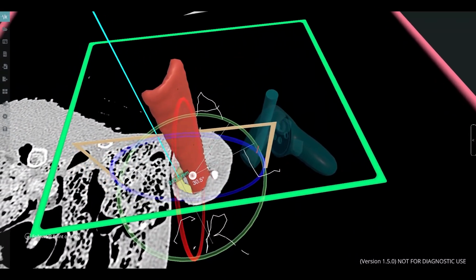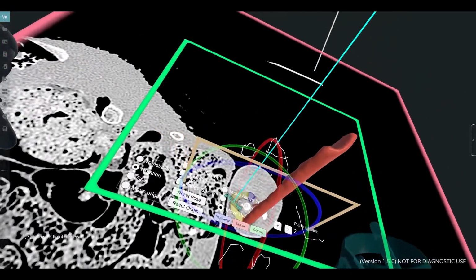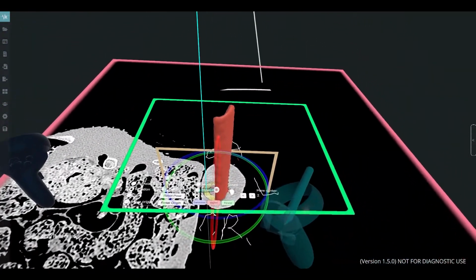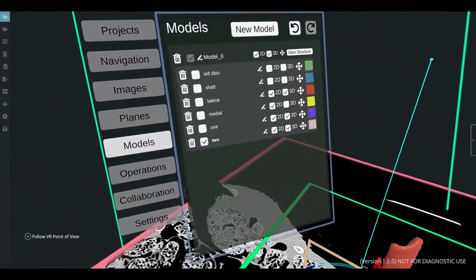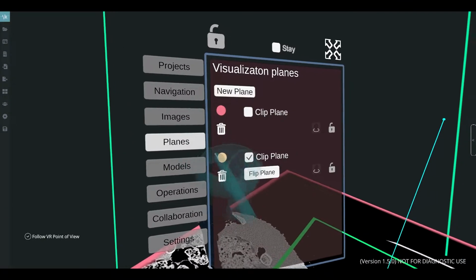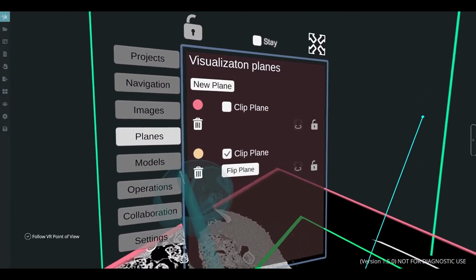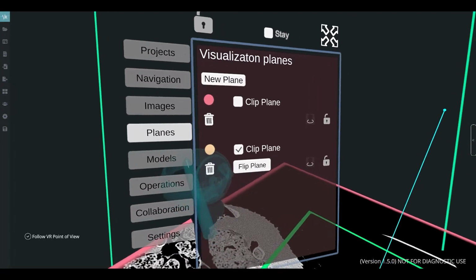We're going to put this video on YouTube, so it's possible to just sort of speed through it. You don't have to watch me. You're repeating the same operation again and again. I actually made a mistake in this video in forgetting to move it to the lateral. So, you can see what happens when you forget to do that.